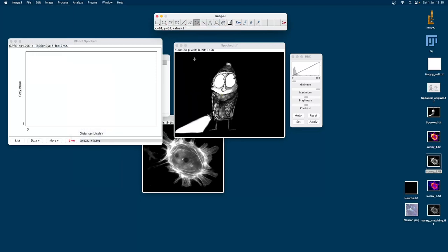But I can right click, I can choose the multi-point tool, and then I don't have to hold the Alt key. And I will just add additional points with the default settings. If I do hold down the Alt key and click on a point, then that will then remove it, if I am accurate enough.